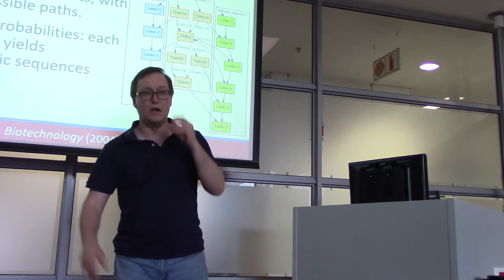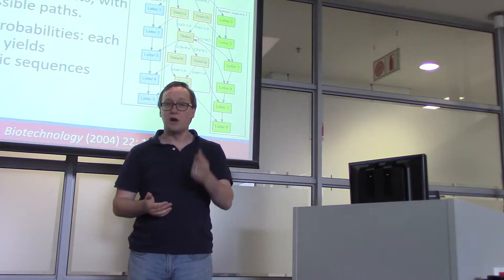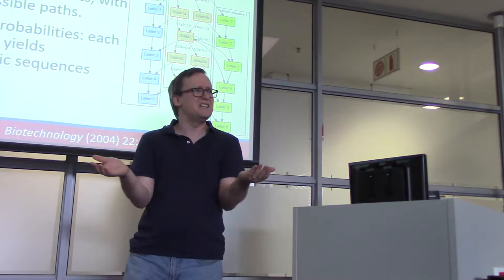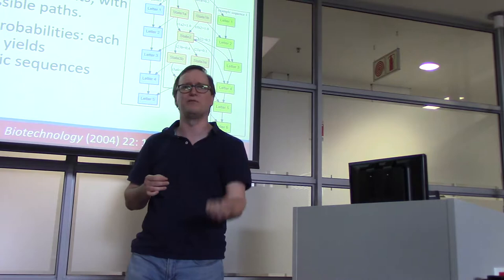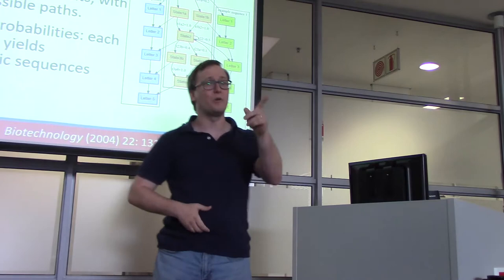All right. Now, again, fitting such a model is really something that's best left to experts, I think, but you should know that hidden Markov models are our principal way of finding protein coding genes in a long contig of sequence. I mean, how would you look at a DNA sequence and just decide where a protein is coded for? That's hard to do. Hidden Markov models know that different features of genes have different sequence probabilities. I'm going to tell you, you already know one of these.